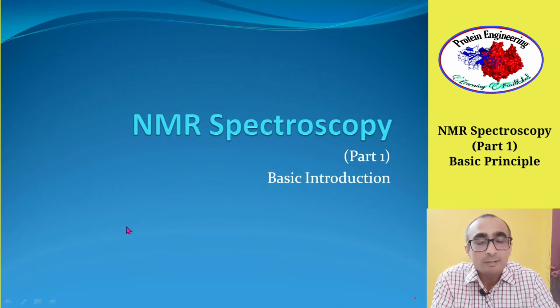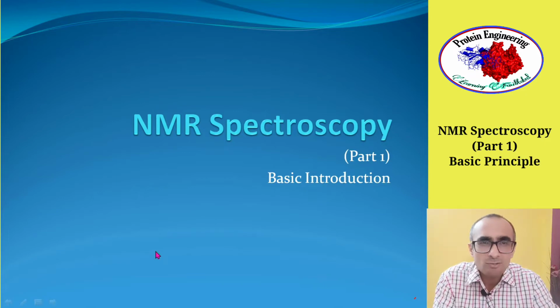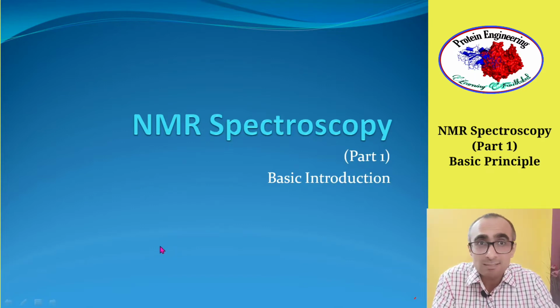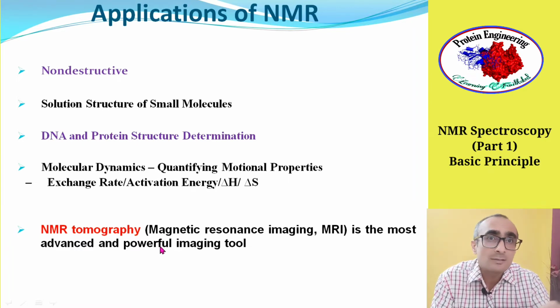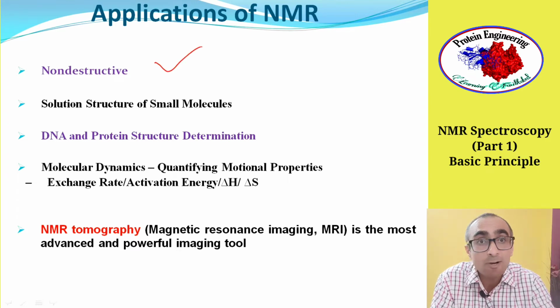Hello everyone. In today's lecture we will talk about NMR spectroscopy, and in this lecture I'll try to give you a basic introduction to how NMR spectroscopy works. NMR spectroscopy means nuclear magnetic resonance spectroscopy. This is a very powerful technique. It's non-destructive in nature. Non-destructive means there is no sample loss. You can reuse the sample after performing NMR.